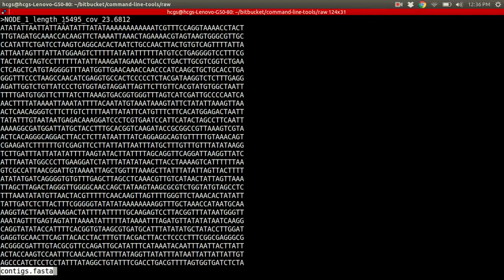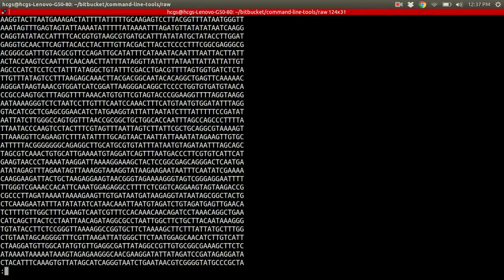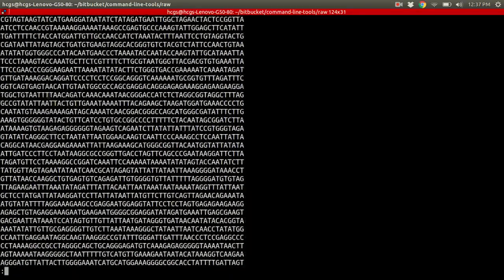And you might get that lucky when you're dealing with eukaryotes to be able to fully assemble a mitochondrion, or you might not. Definitely with bacteria, you're going to have multiple contigs. So don't think it's going to be easy, but at least here's an example where we actually have a fully assembled genome that we can also move forward with Prokka.